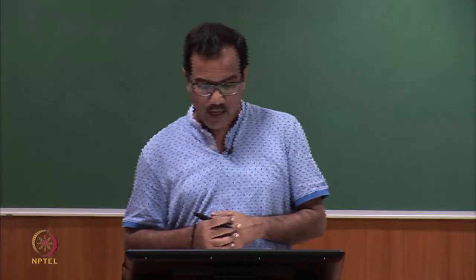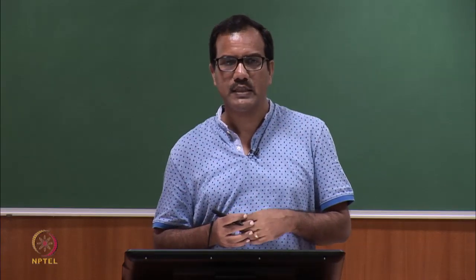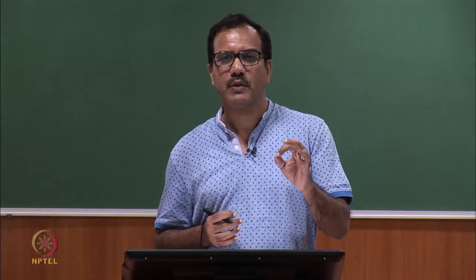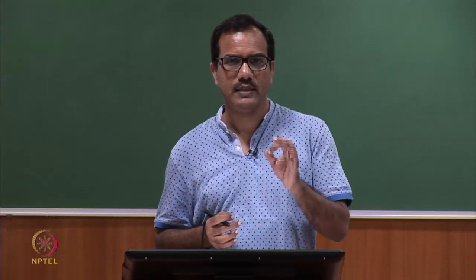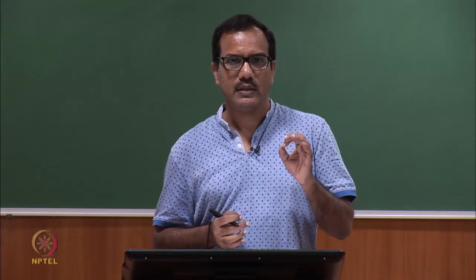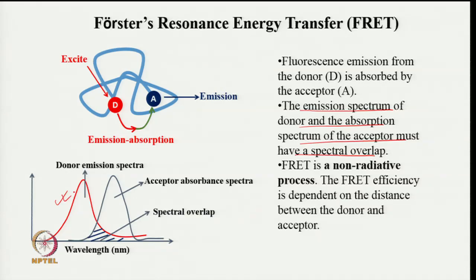Only then can this phenomenon take place. Another important point about FRET is that it is a non-radiative process, and the FRET efficiency depends on the distance between donor and acceptor. You can see this is the donor emission spectrum and this is the acceptor absorbance spectrum. If there is a spectral overlap, only then can FRET take place.